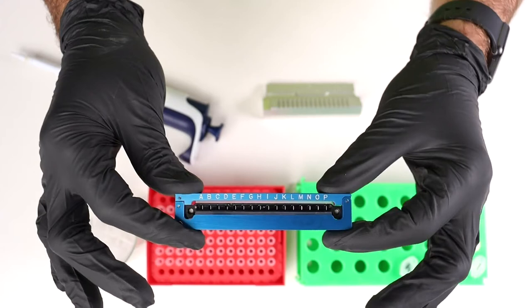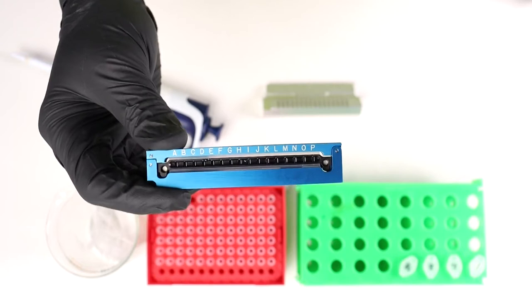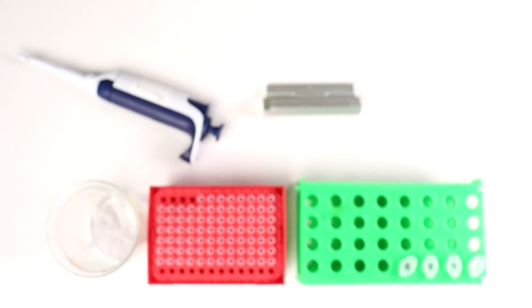That's all there is to it. Sample is ready — all those samples are in there, nice and secure. When I say secure, I really mean it. I've actually dropped UNIs before and they've been just fine, and I've still been able to do experiments with them. If you've ever tried to do something similar with a plate, you know how much of a pain that can be.